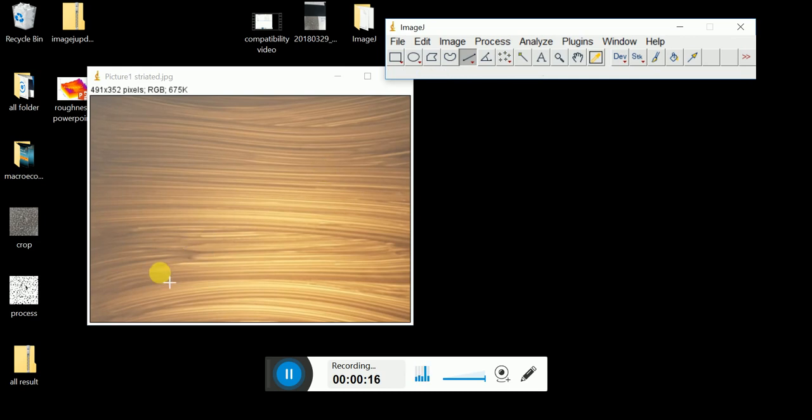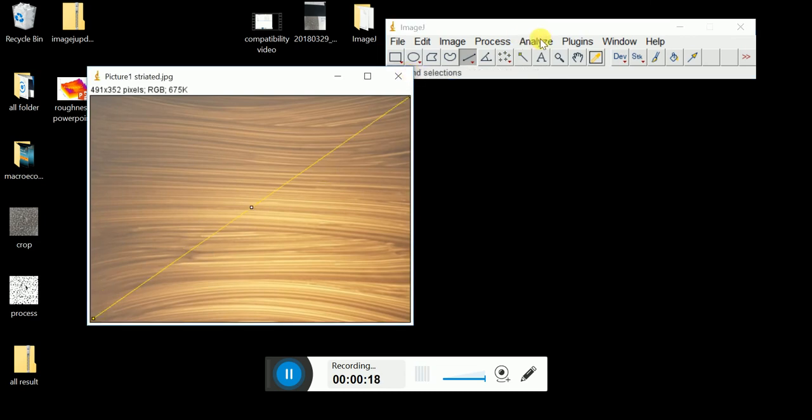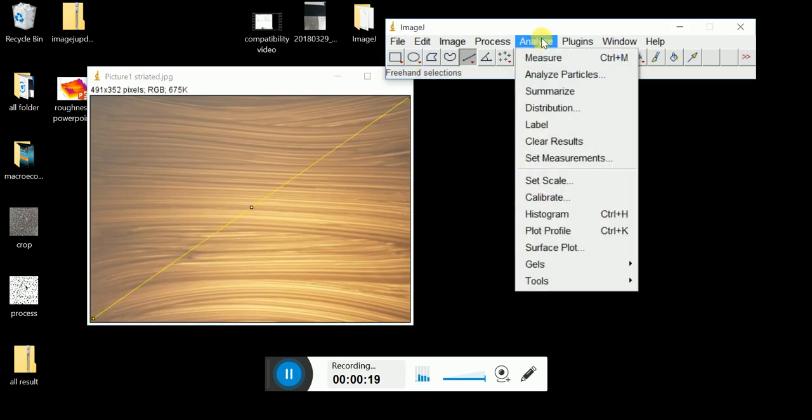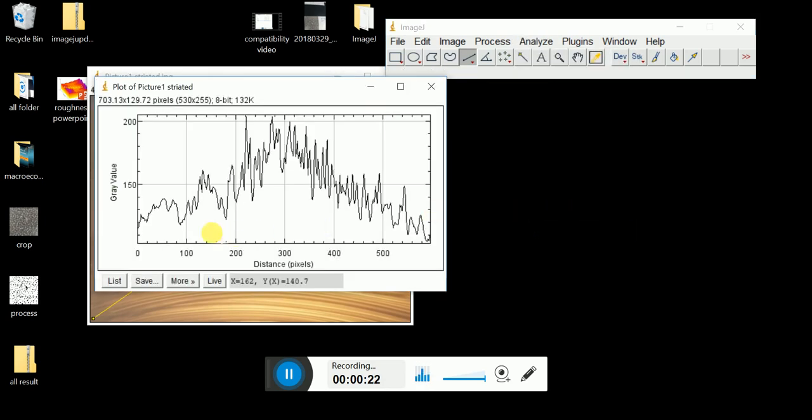Draw a straight line from one end to another end. Click Analyze, Plot Profile. So you will see it's a curve.